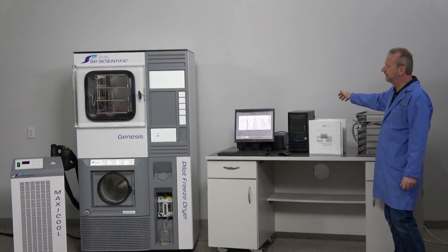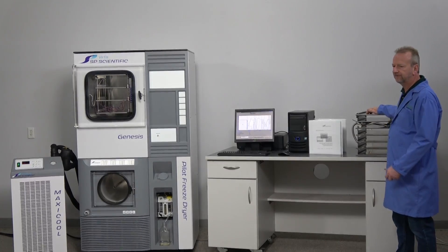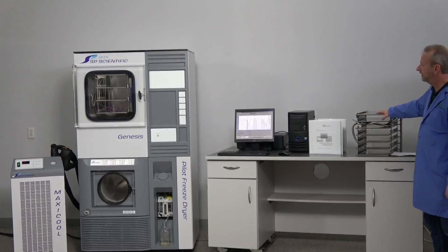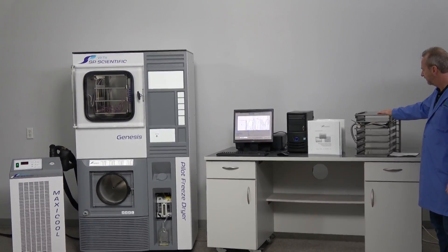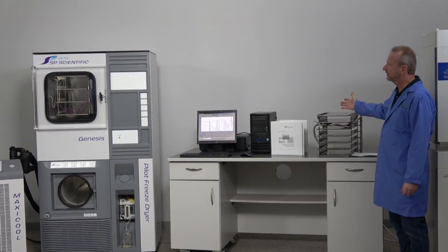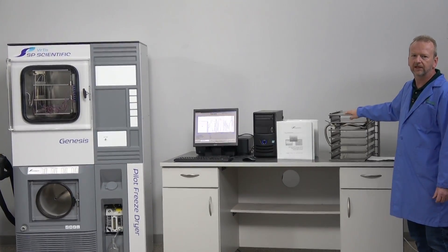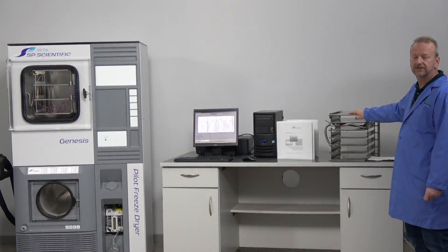Everything is really easy, plug and play — just connect everything, the software fires up, and you're ready to run. It's a turnkey instrument. If three shelves isn't enough, a quick switchover to the six-shelf unit is simple: just unbolt it, slide it out, slide the other one in, and you have ample room for smaller or larger samples.